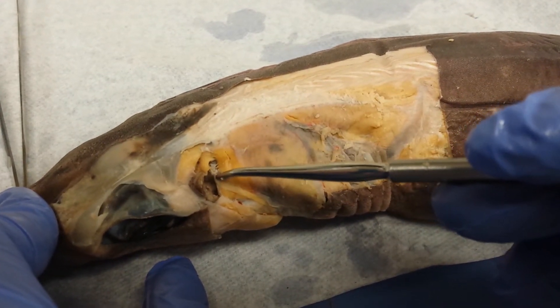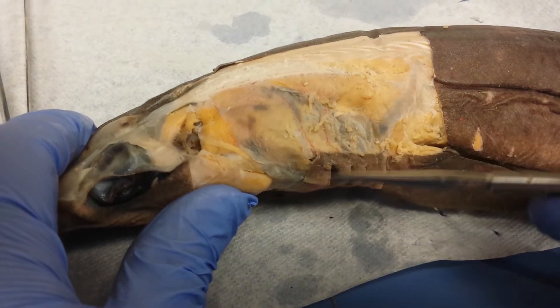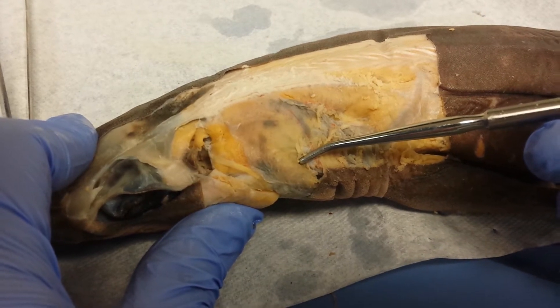Then now I move to the second gill constrictors. It goes here and goes all the way to the first gill slit that is here. So all this muscle here is your second dorsal gill constrictor.